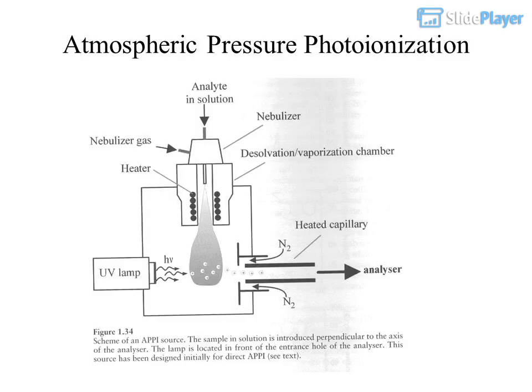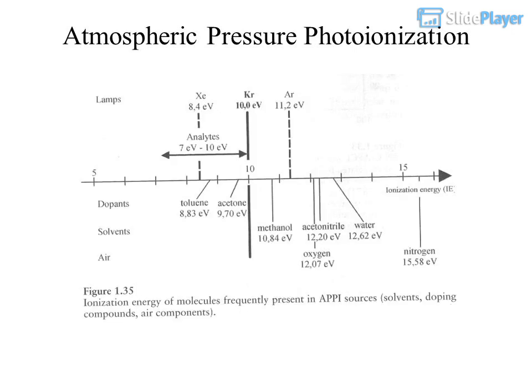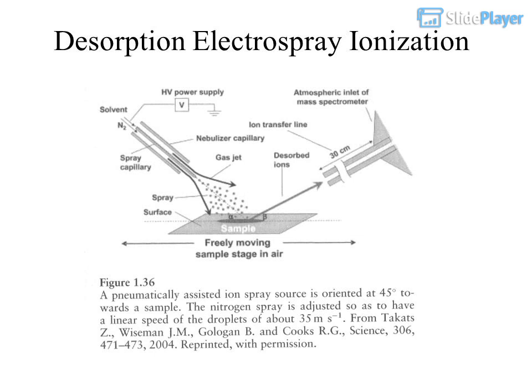Atmospheric pressure photoionization. Desorption electrospray ionization.